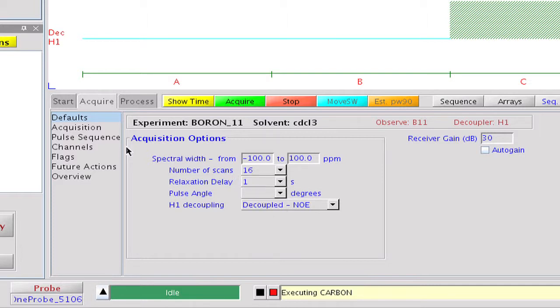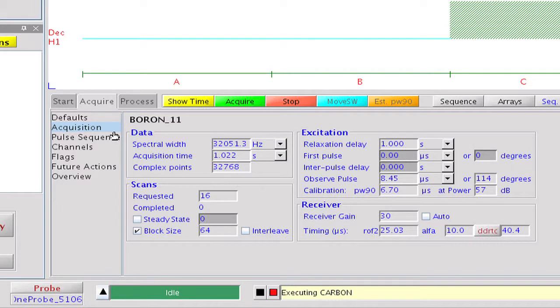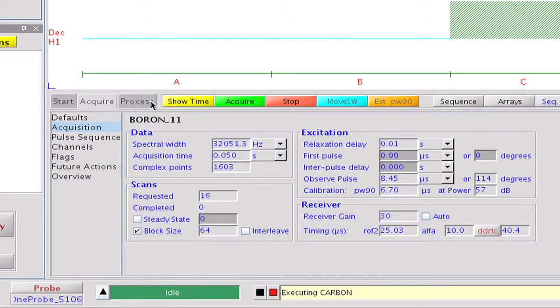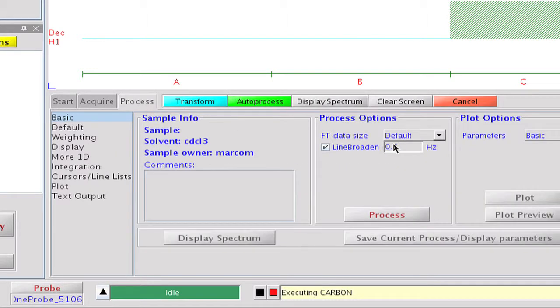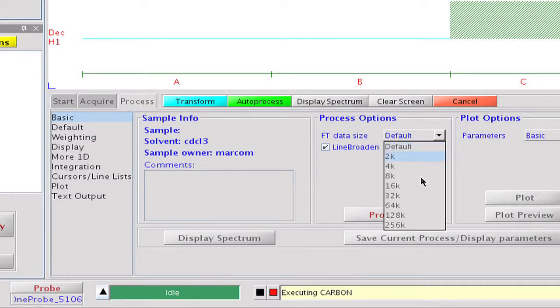Due to its quadrupolar nature, boron relaxes much faster than carbon. Therefore, we can reduce the acquisition time to 50 milliseconds and the relaxation delay to 10 milliseconds. Finally, we select a 10 Hz line broadening and set the Fourier size to 16k.